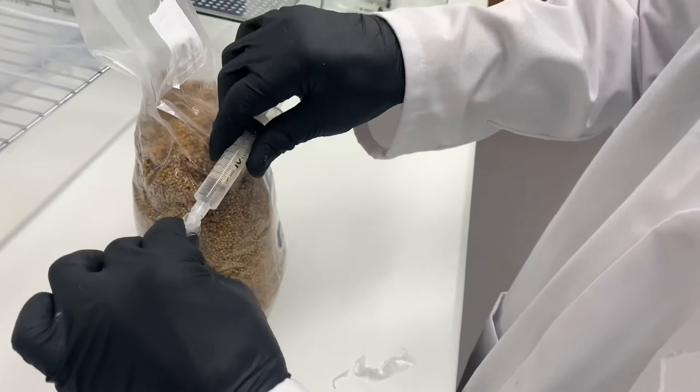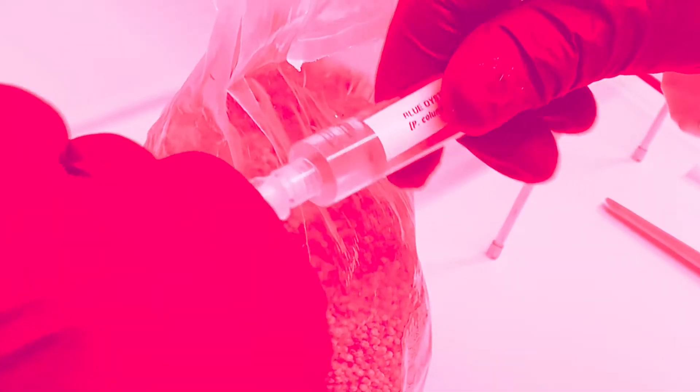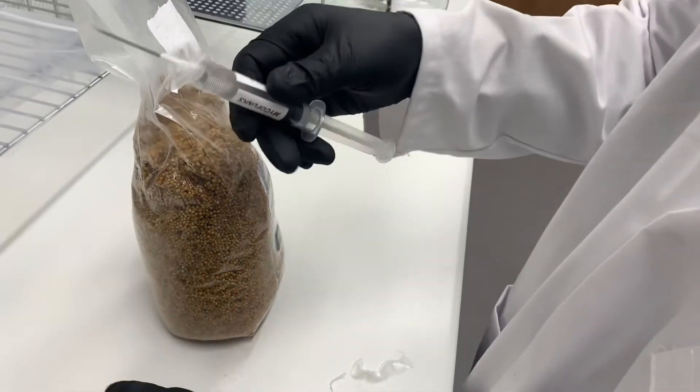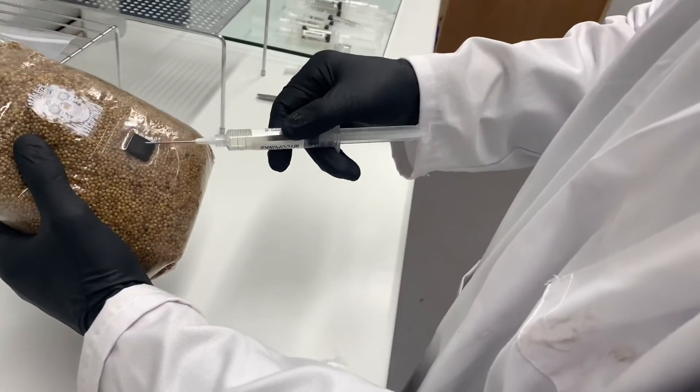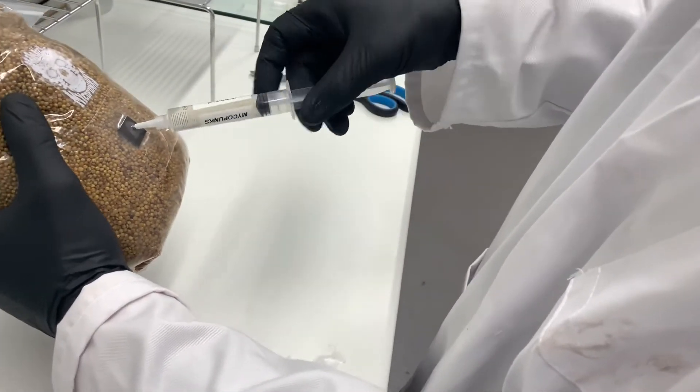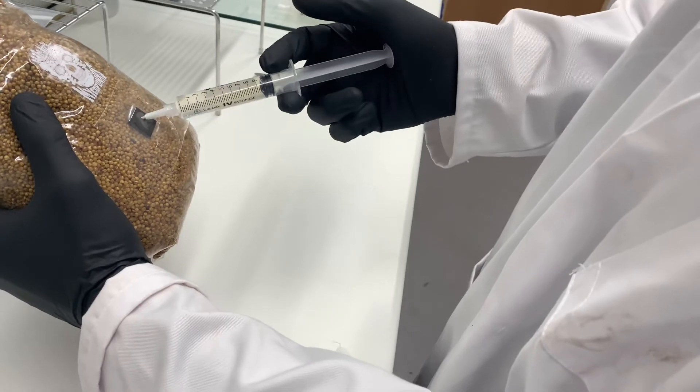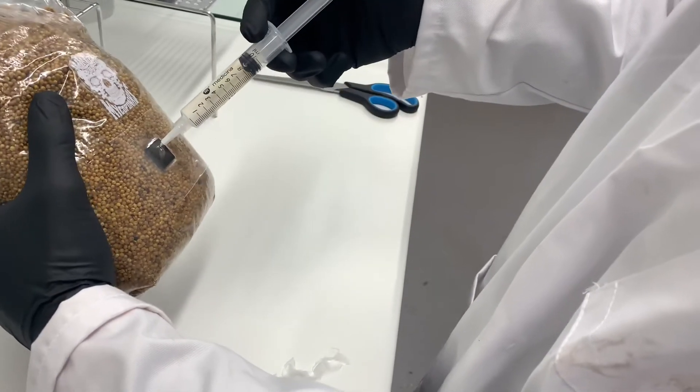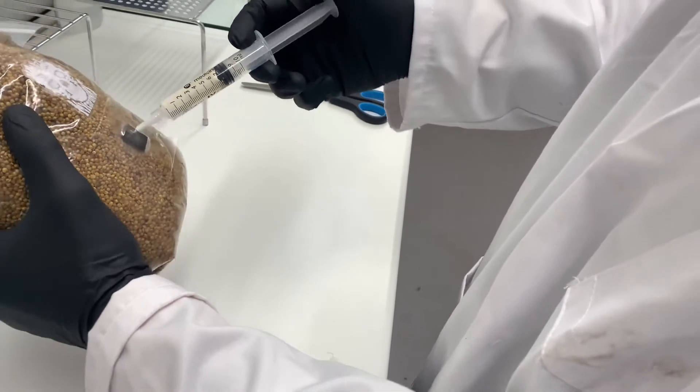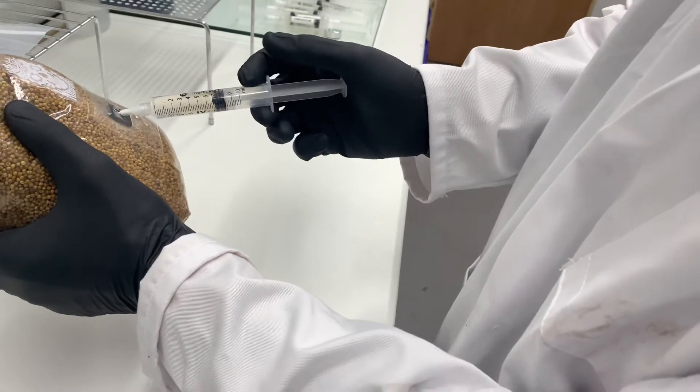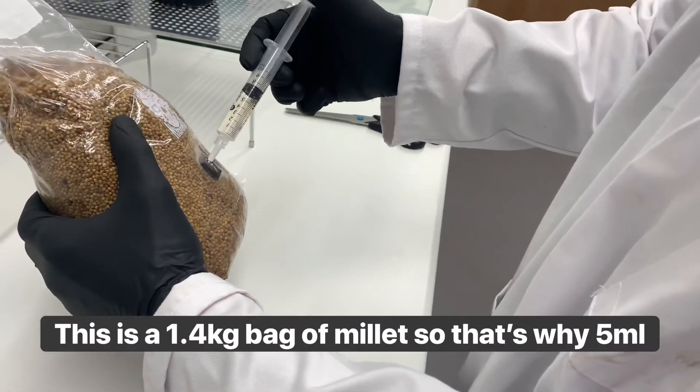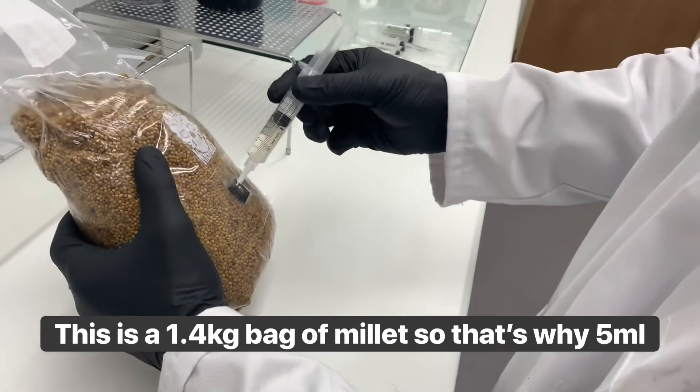Now watch out taking this off because Anthony takes it off like a right madman. He almost stabbed his finger, which would have been ace for the video. There we go, right. So we're going to put five CCs in and we're going to just put it in around the bag, make sure there's lots of points of inoculation. So you really, between two and five milliliters of liquid culture is fine.